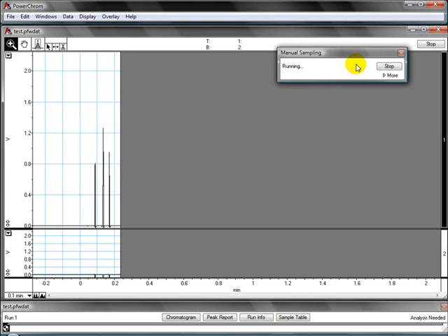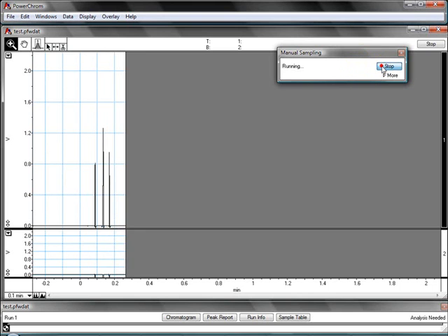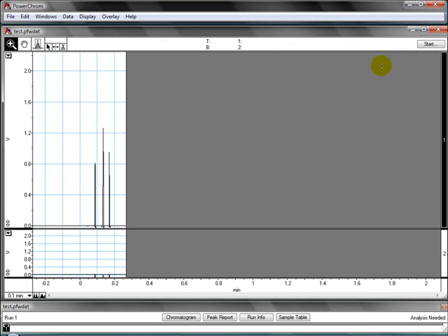Once you've recorded all your peaks, you click on stop. And you can repeat clicking start for all of your standards and samples.